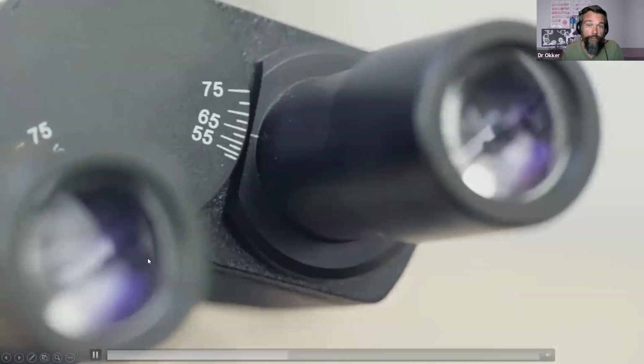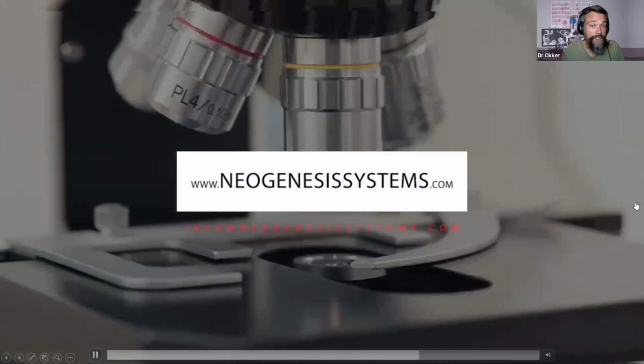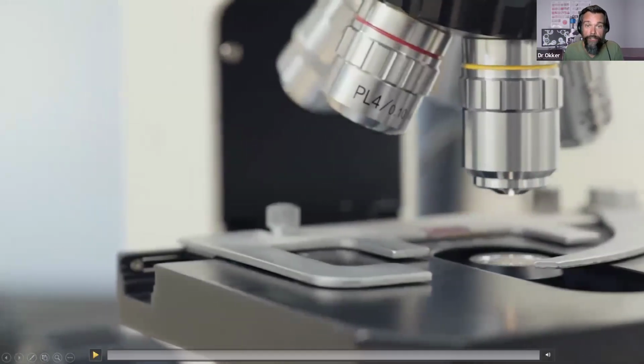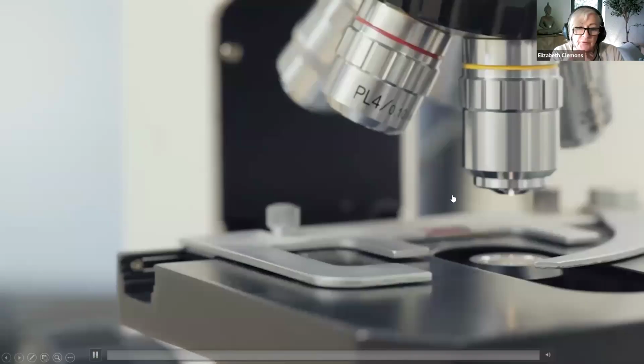All right, so just an example of what the microscope looks like, and we will cover more detail in a later webinar on what to actually look for in a microscope and some examples of what we see when some of those features or specifications have not been met. Very important, isn't it, to have the right microscope? We get so many students that make expensive mistakes.